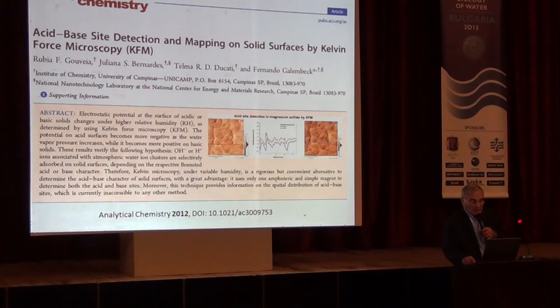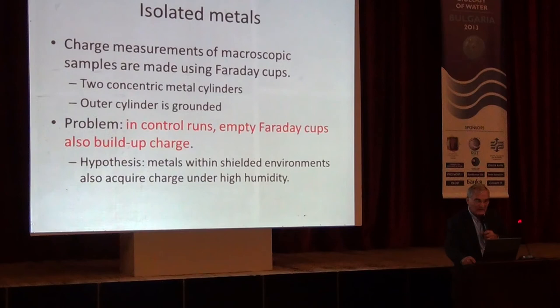And using this, at the end of last year, we published this paper showing that there is a very chemical application. We can detect acid-base sites on solid surfaces, which is very important for characterizing catalysts and adsorbates, by using Kelvin force microscopy. And the only reagent to do these determinations is water, which, by the way, is amphoteric.